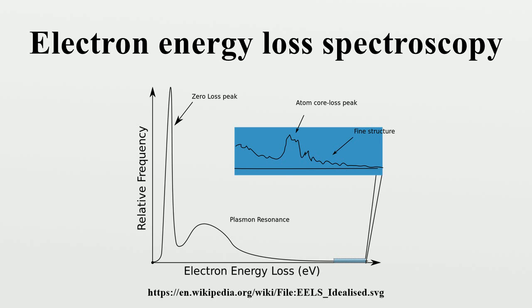EELS in confocal geometry. Scanning confocal electron energy loss microscopy is a new analytical microscopy tool that enables a double-corrected transmission electron microscope to achieve sub-10 nanometers depth resolution in-depth sectioning imaging of nanomaterials. It was previously termed as energy-filtered scanning confocal electron microscopy due to the lack of full spectrum acquisition capability.